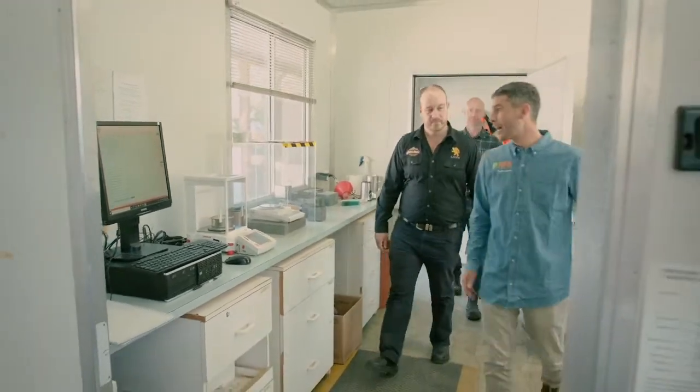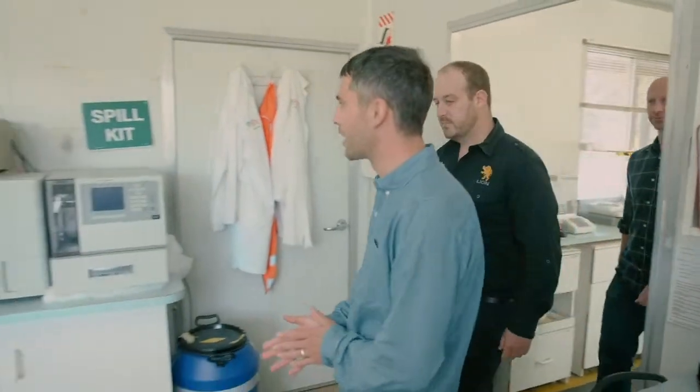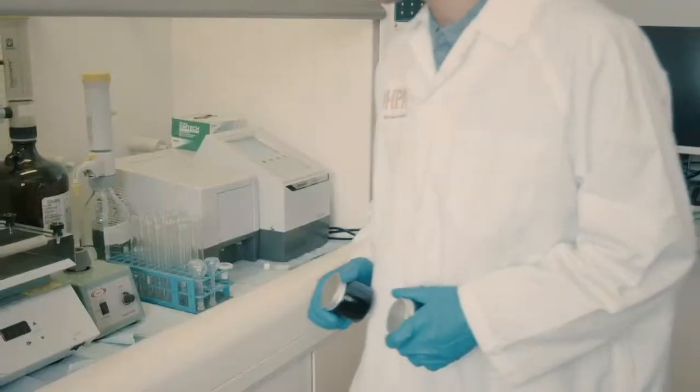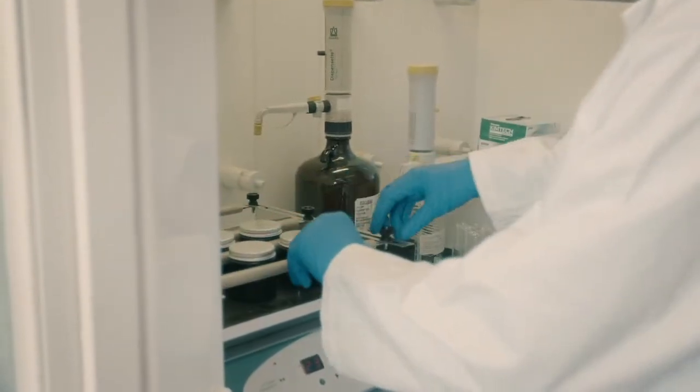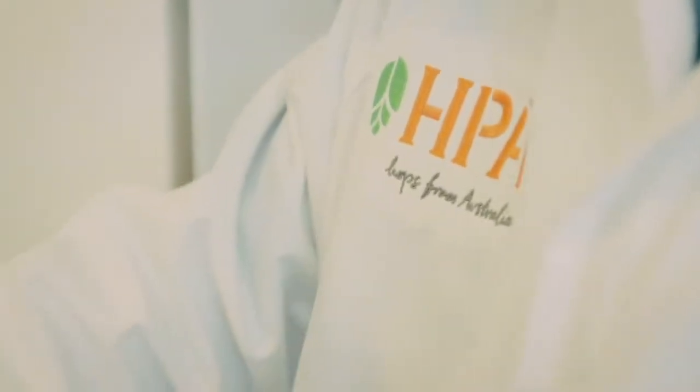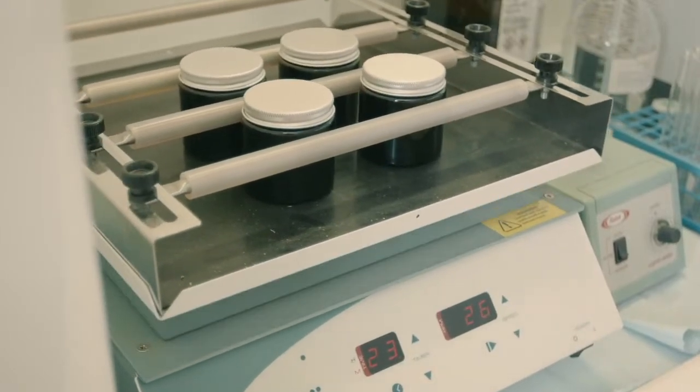So this year we have a new lab set up next to the bale press so that we can get results for alpha acid and oil contents in a much quicker fashion. That's got to be really good for quality, doesn't it? Yeah, so it means we're producing hop storage index values for every bale that comes through, which will give us better quality outcomes in the blends.